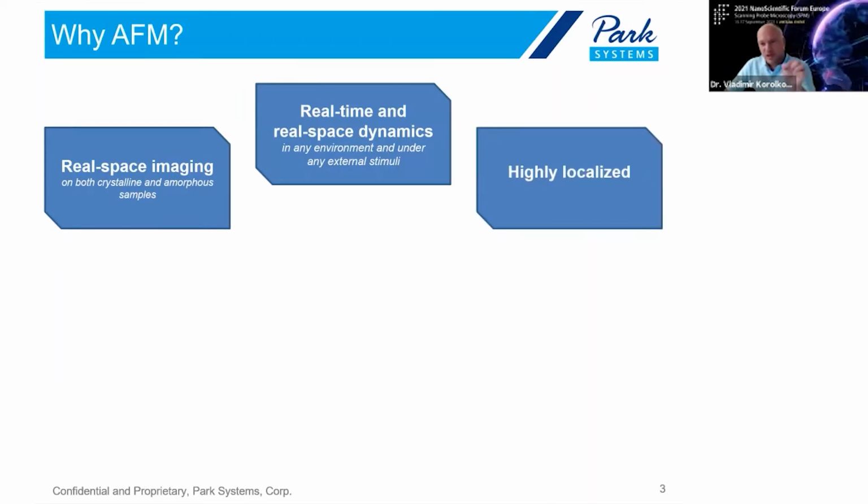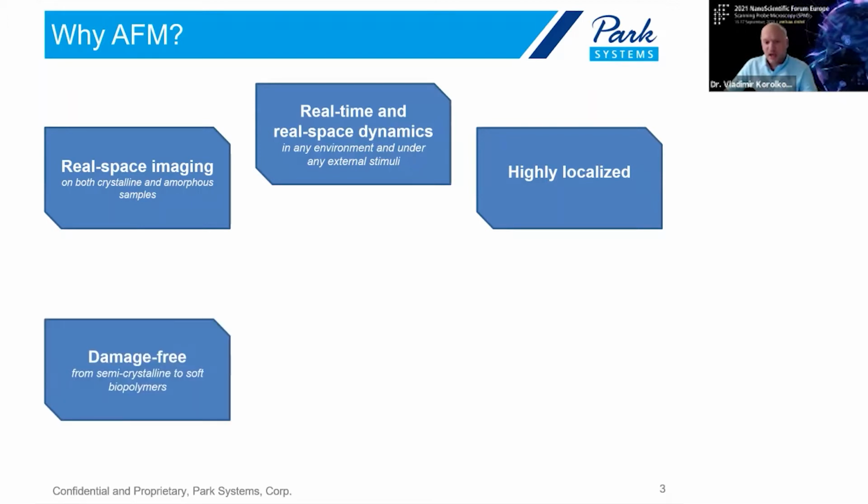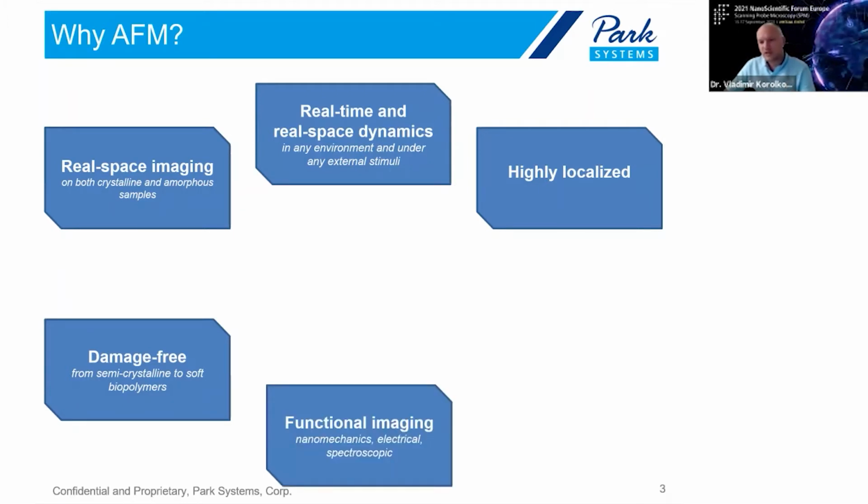Those measurements are highly localized because you use a very sharp probe, so the measurements come literally from a few nanometers of your surface. They're damage-free, so you do not need to damage your sample to get that information. And because you're always interacting with your sample, you can do functional imaging.